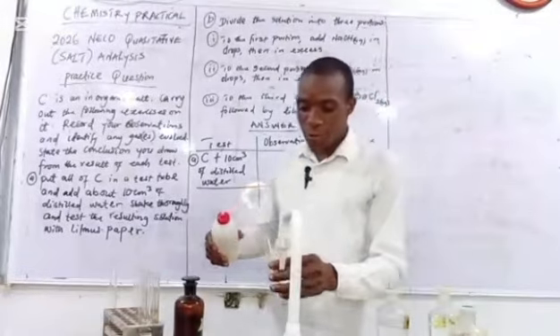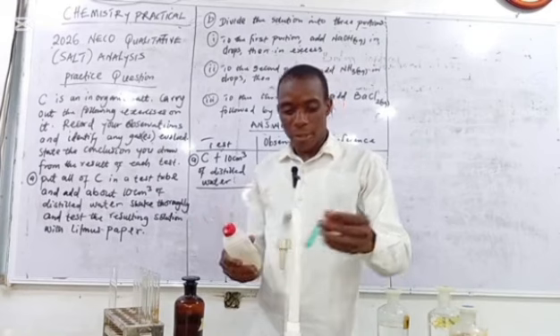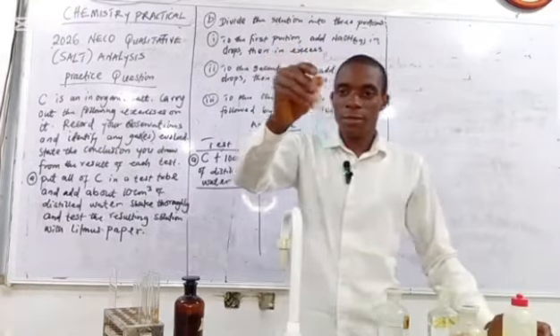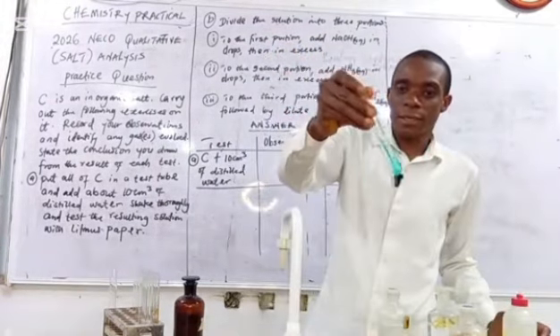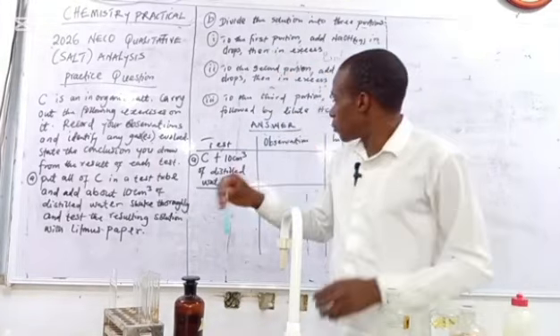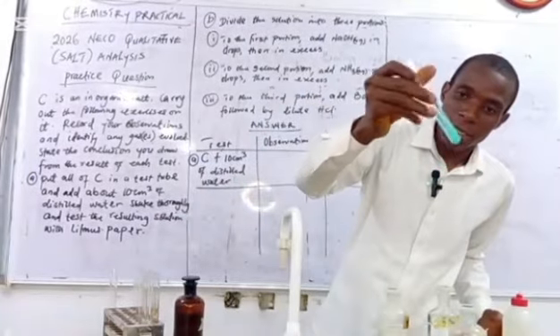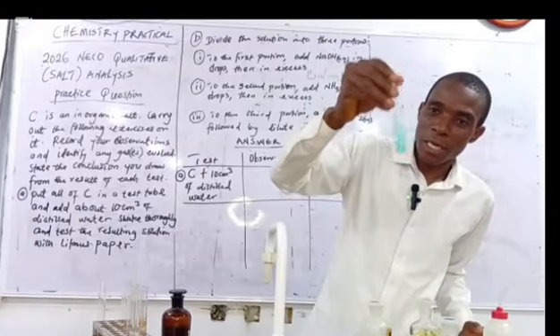We are going to do that right now. About 10 cm cube. We have added distilled water here, and then we'll shake it thoroughly and observe what happens.